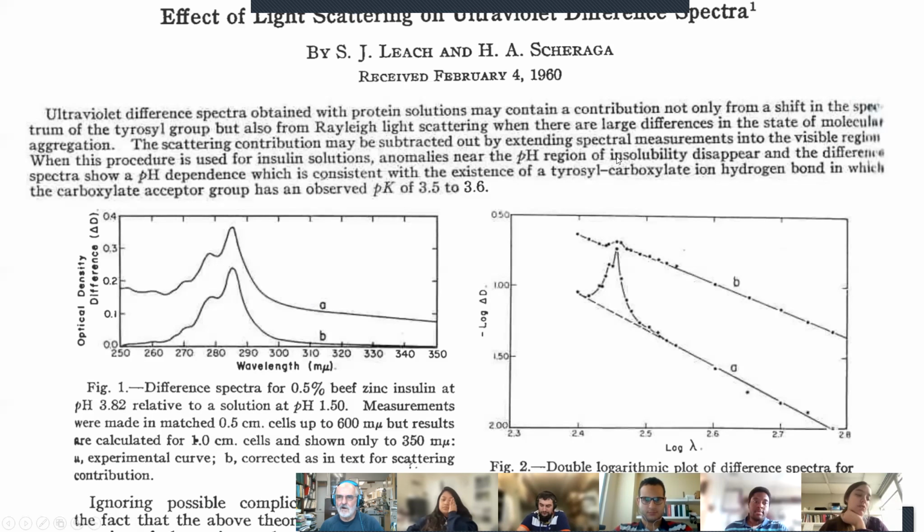In insulin, there are, in fact, multiple disulfides, so they're contributing here. But then out here in this higher wavelength region, you're getting a change in the absorbance as a function of wavelength. This is all due to scattering, okay?